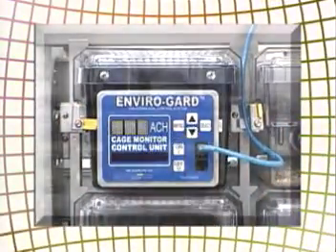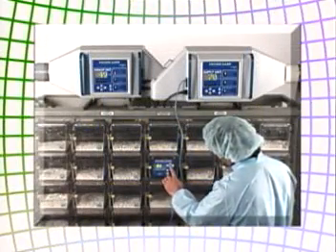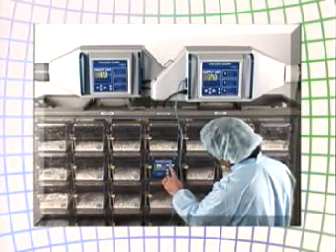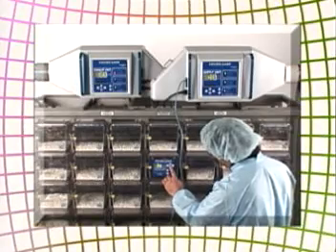In addition, you can electronically monitor, record, and transfer key microenvironmental data from individual cage locations.